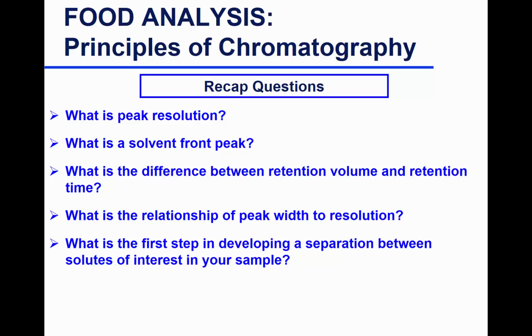What is a solvent front? All of you experienced that today. What? It's basically the clearing out of the void volume, and then you solve the peak, which means your experiment's actually getting through. Yes. So the void volume, from the time of injection to the time where the solvent hits the detector, that's the void volume. And then when the solvent hits the detector, the detector recognizes the solvent. So it gives you a hiccup. It tells you, hi, solvent, there's a peak that shows up.